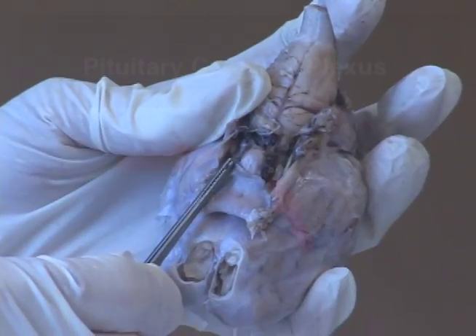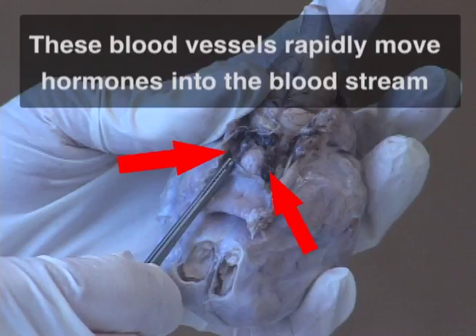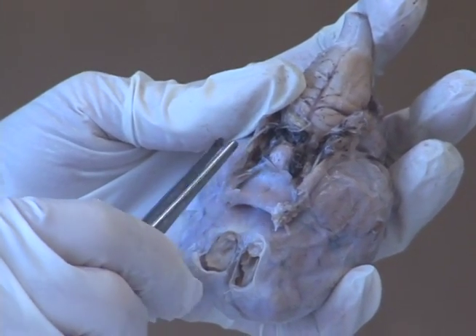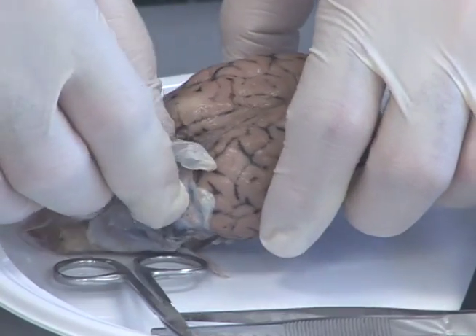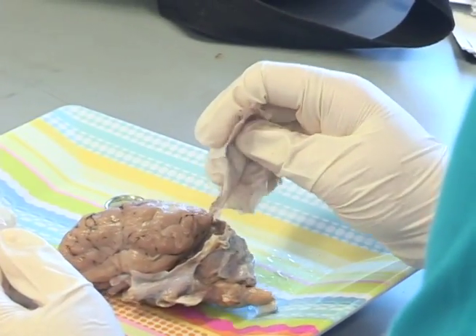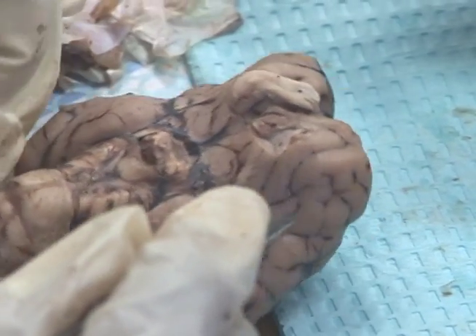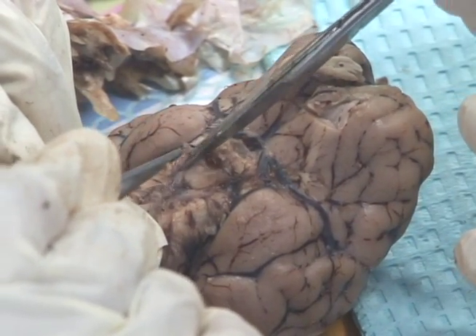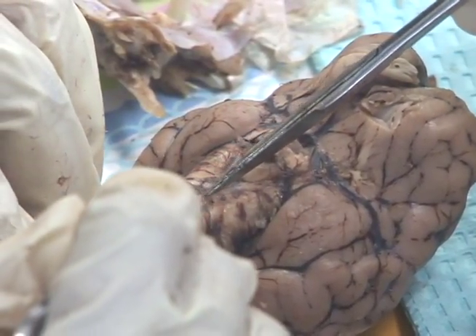That's a gorgeous pituitary. You've got nice trigeminals. Nice optic. Can you find the circle of Willis or any of these blood vessels? Right here and right here — it comes down like that. This is your basilar right here. There's not much blood in it, so it's hard to see.